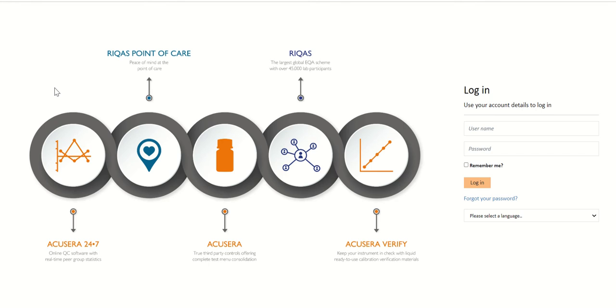Hello and welcome to the Randox AccuSera 24x7 training series. In this part we're going to be going over the logging in portion of AccuSera 24x7. To gain access to this website, open a preferred browser and type QC.Randox.com into your URL to access this web page.